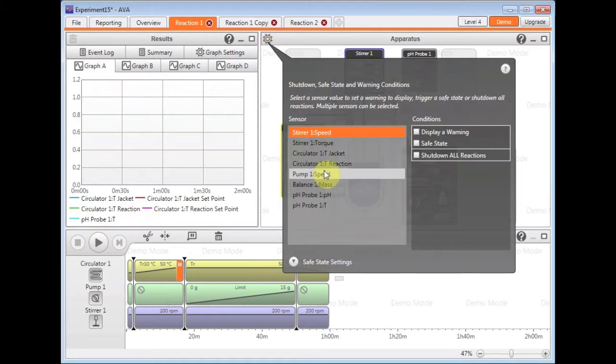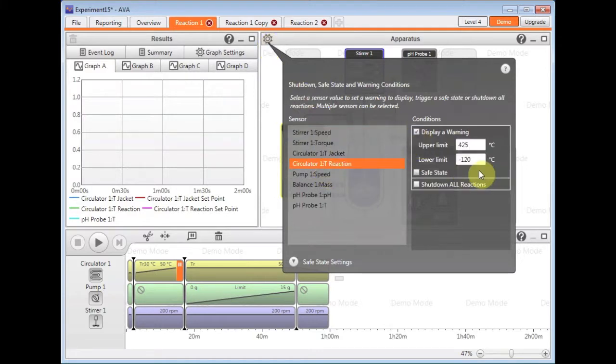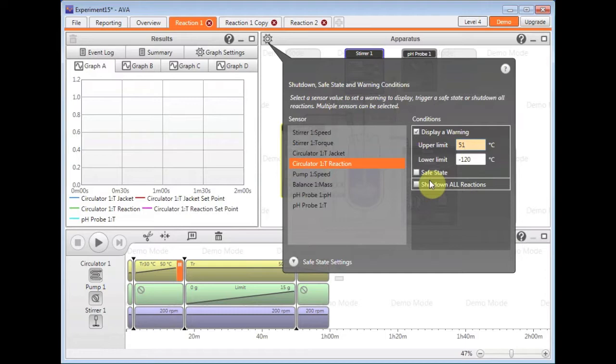And you can, for example, display a warning if the temperature is above 51 degrees. That will make the actual sensor box go yellow and draw your attention to it.